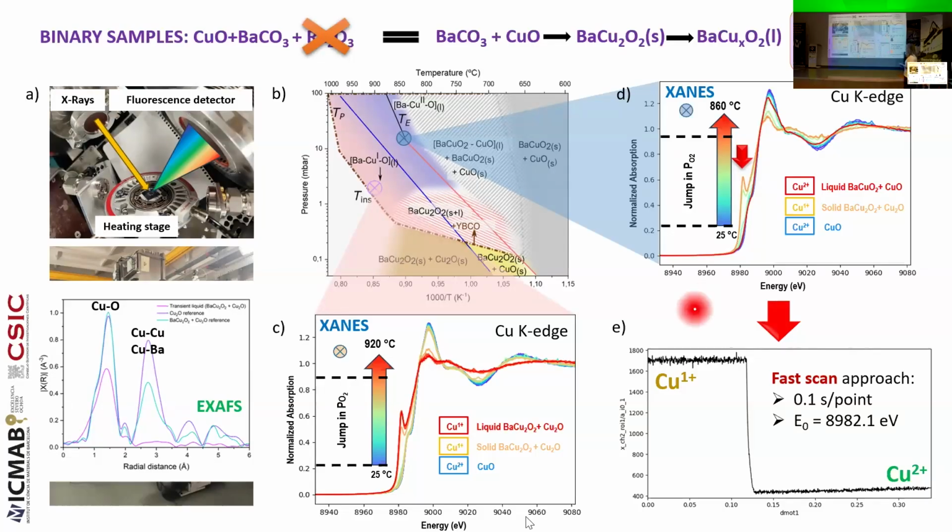And then just scanning across during the pressure jump with 0.1 second per point of acquisition rate. And you can see, for the same exact process parameters, we get very nicely the intensity of the copper +1 and then a very sharp drop to the copper +2 valence state. And this allowed us to make many experiments also with the ternary samples, actual growths of REBCO films.